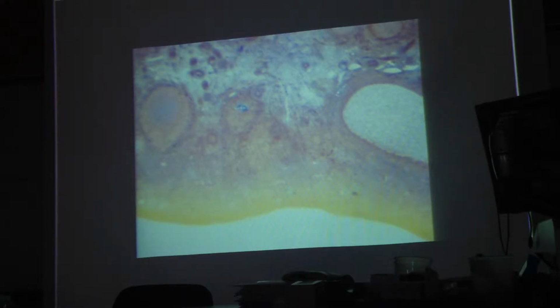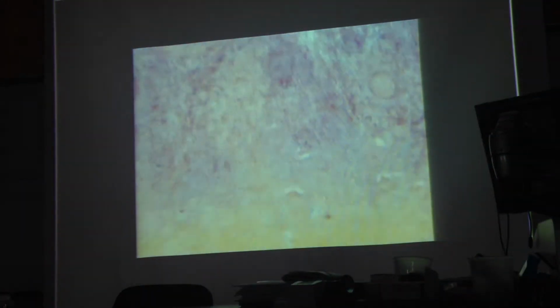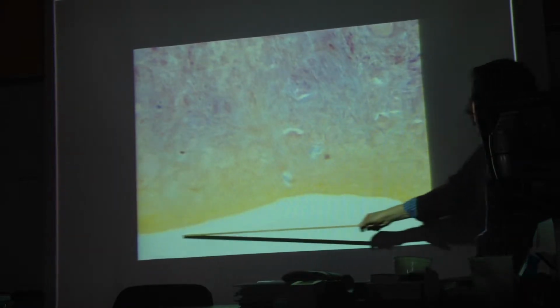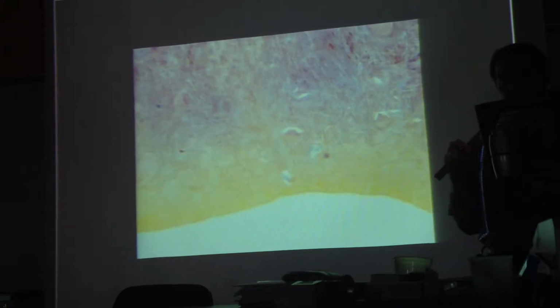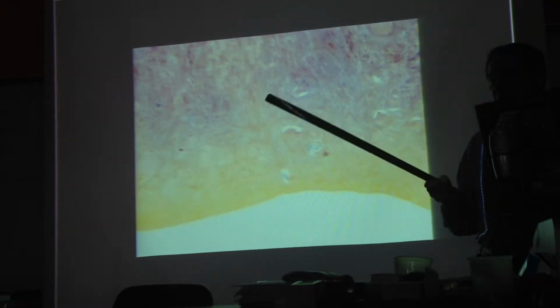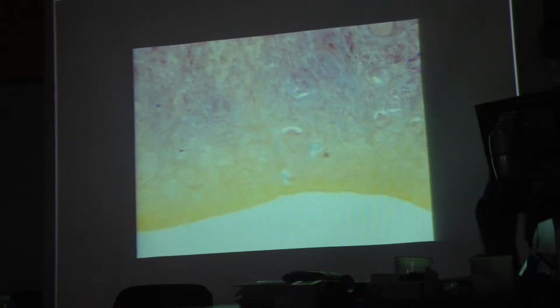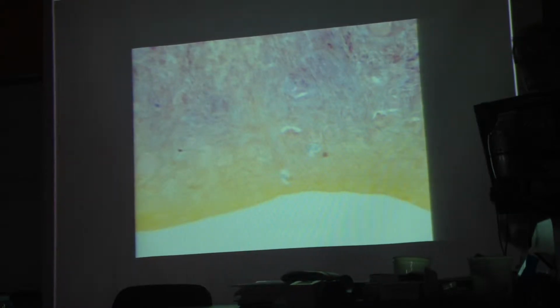On the very outside is a single layer of cuboidal epithelium, so it's simple cuboidal epithelium. It's this dark kind of yellow line right here. What do we call that? You also see it on the model of the ovary, that pink outer layer. What's it called? The germinal epithelium. An unfortunate name, because you think something's germinating or beginning there. It's not. It's just this outer surface layer.